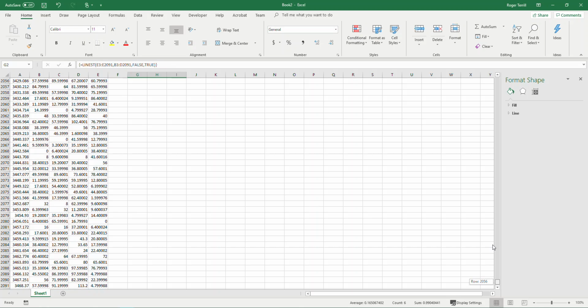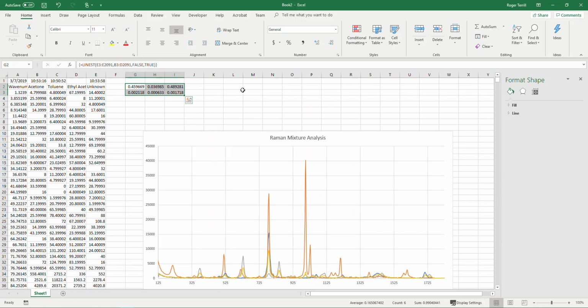Now I'll slide on back up there. And there's our coefficients, and let me put their names on them. This is acetone, toluene, and ethyl acetate. Right? And these coefficients are pretty good there. So if we look at this guy, I'll trim the sig figs until we get down to, say, 1 sig fig in the uncertainty there.